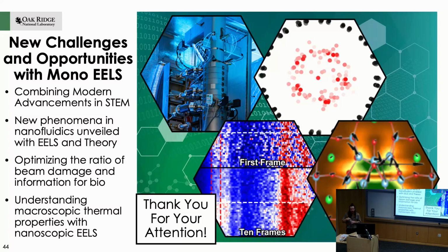Yeah, so right now we've looked at mostly fixed samples that were fixed in resin, but we've also been pushing towards cryotransfer, and we have cryotransfer set up in our instrument right now. So one of the things we're really excited about moving forward is doing frozen, vitrified samples in their native form with no resin infiltration and looking at the vibrational spectra there.